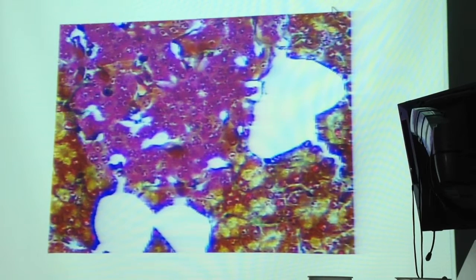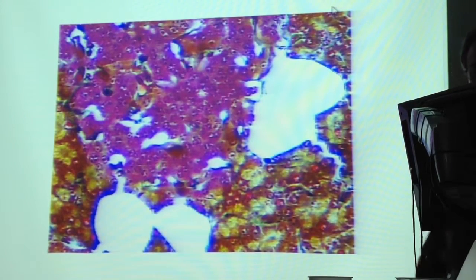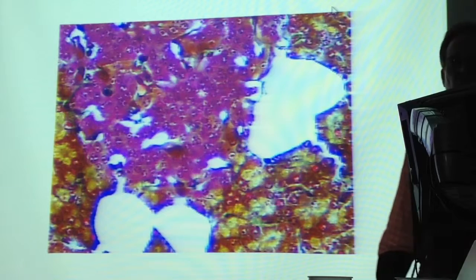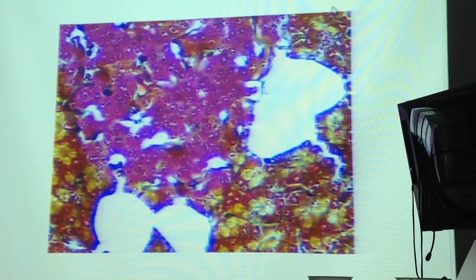Okay, so four hormones. Beta cells, these rose pink cells, produce insulin. Next most abundant, the dark brown cytoplasm cells, alpha cells, produce glucagon. Third most abundant, the tan cytoplasm cells, delta cells, produce somatostatin. And then the F cells, you don't have to pick out, produce pancreatic polypeptide. Okay, so know those four hormones, the cells producing them, and what those hormones do. Any questions?